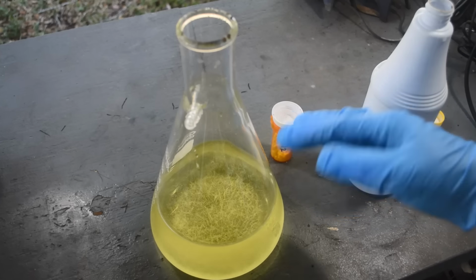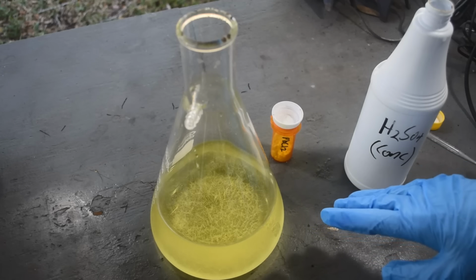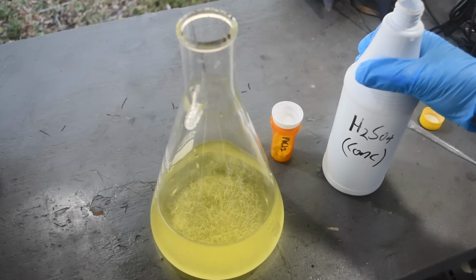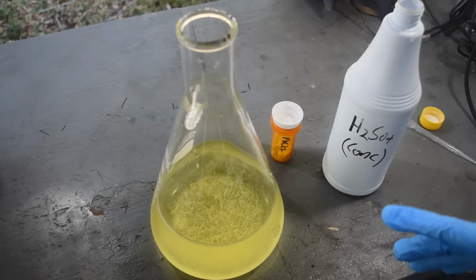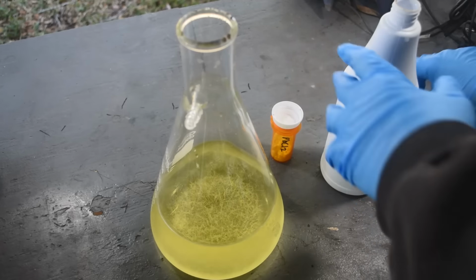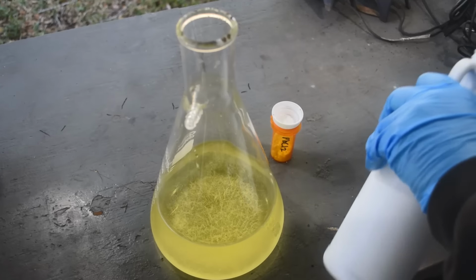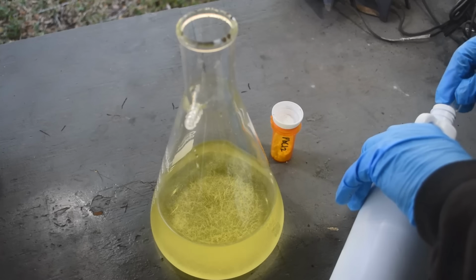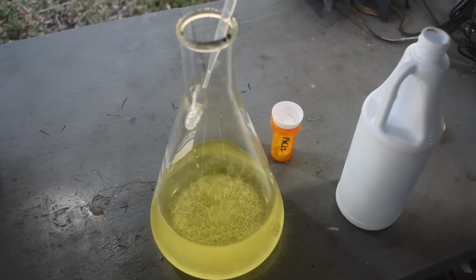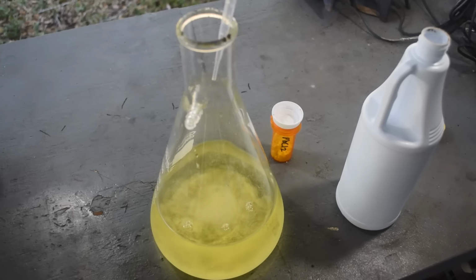I mean, letting this stuff cool, we got a lot to crystallize out. That's great. But I'm going to put some concentrated sulfuric acid in here, just a little bit, and lead sulfate is really insoluble, so whatever lead is left in here ought to come out of solution. I made this concentrated sulfuric acid, by the way, and I have a video on that as well, so I'll put a link to that in the upper right if you're at all interested in making your own concentrated sulfuric acid. So I got about 2 milliliters here. Put this in, see what happens. Okay, there we go. We are getting a precipitate.